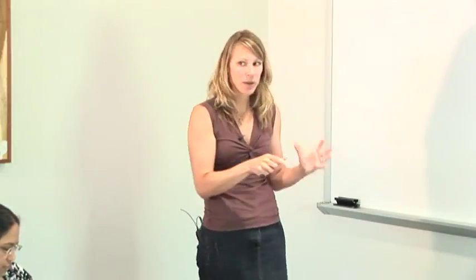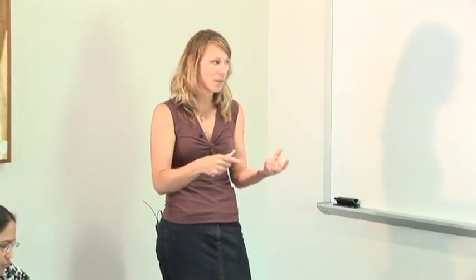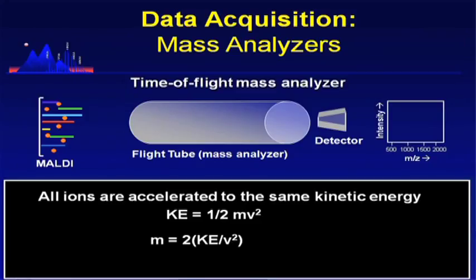The way we correlate this time measurement with mass is based on this equation. We're trying to determine mass, so we can solve this equation using basic algebra for mass. Then we look at our variables. v is velocity, which corresponds to meters per second.